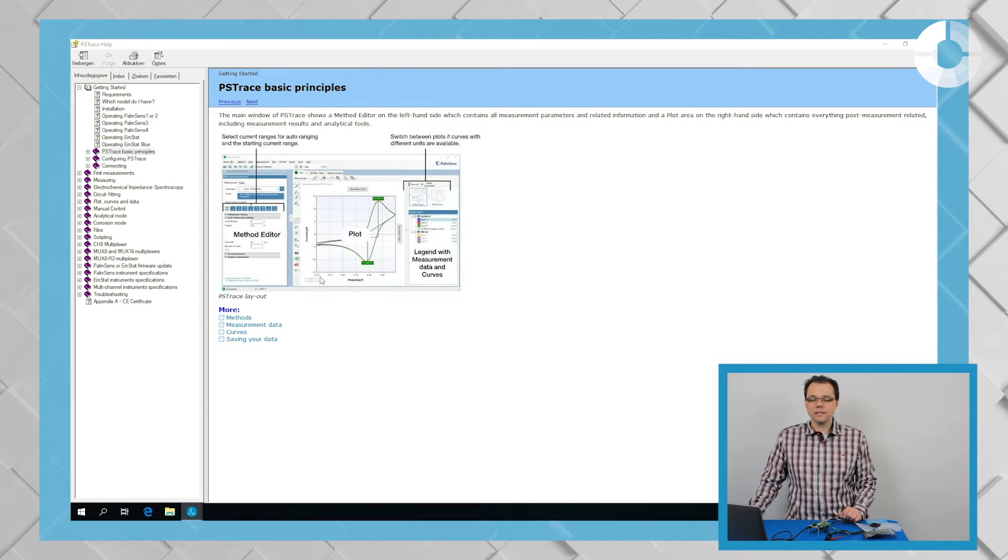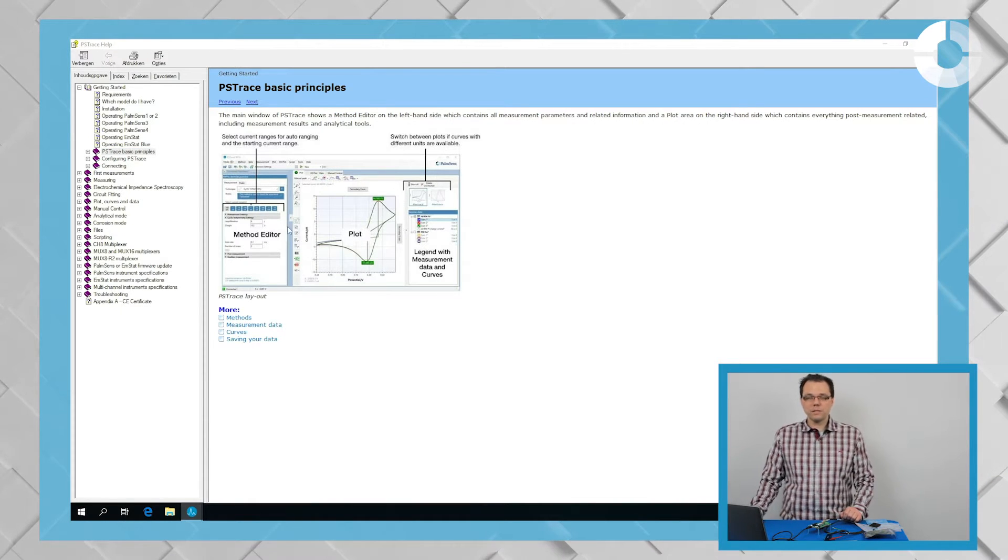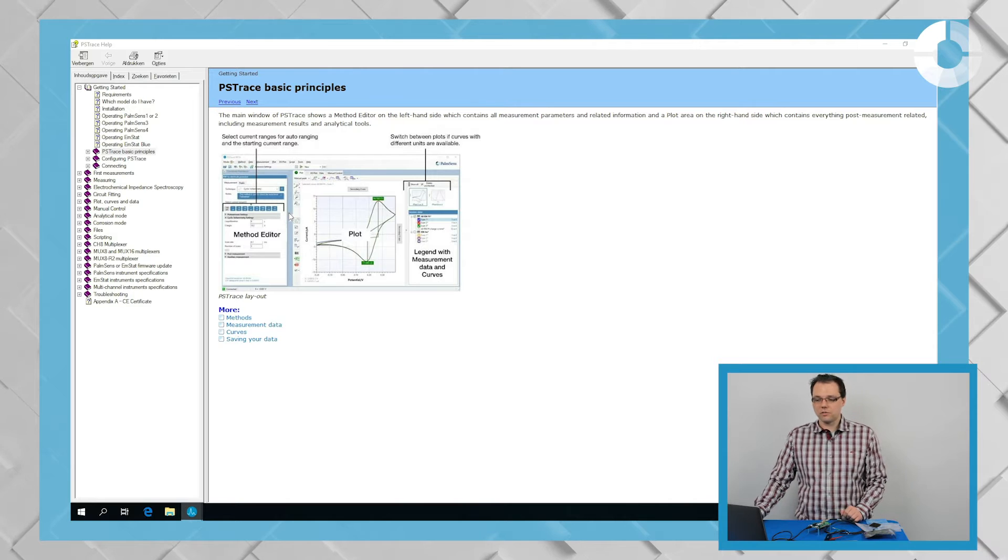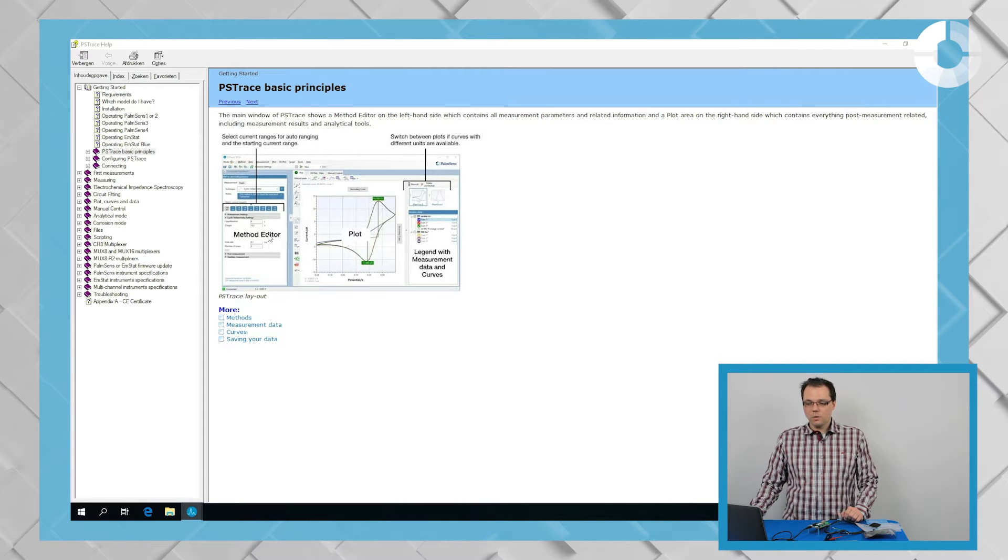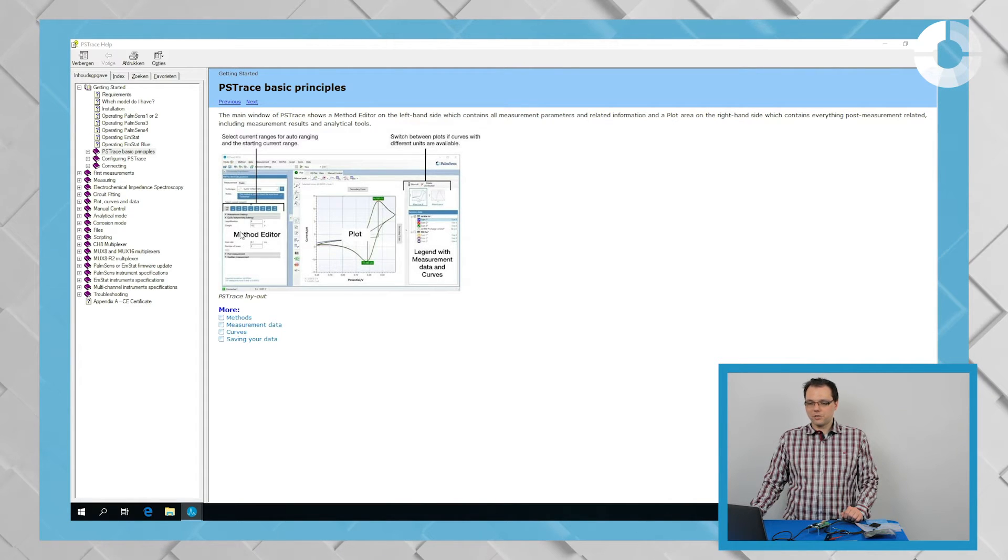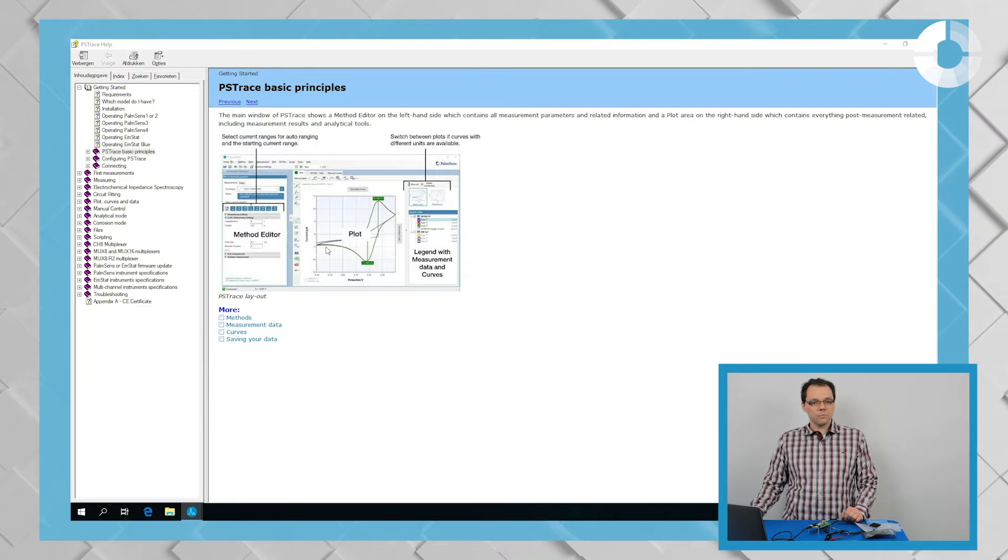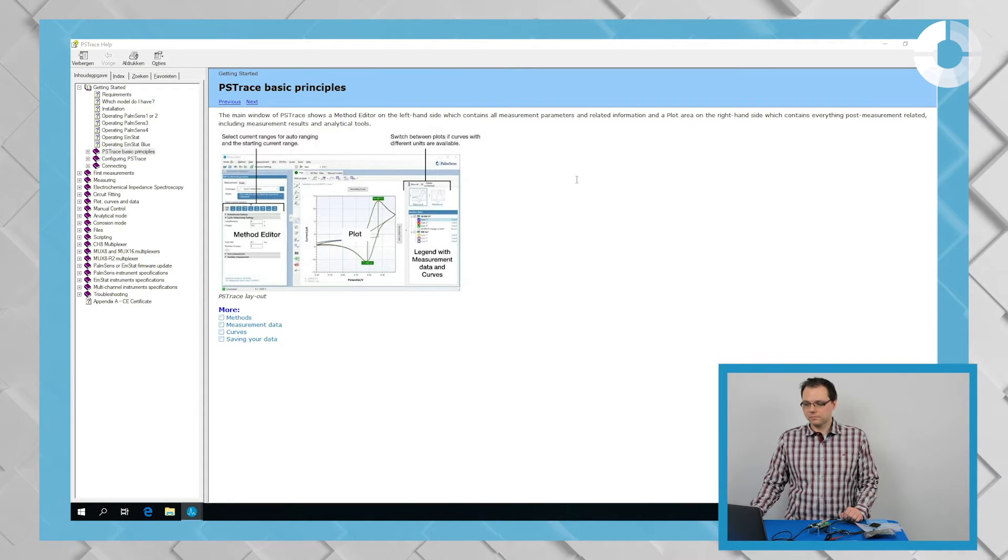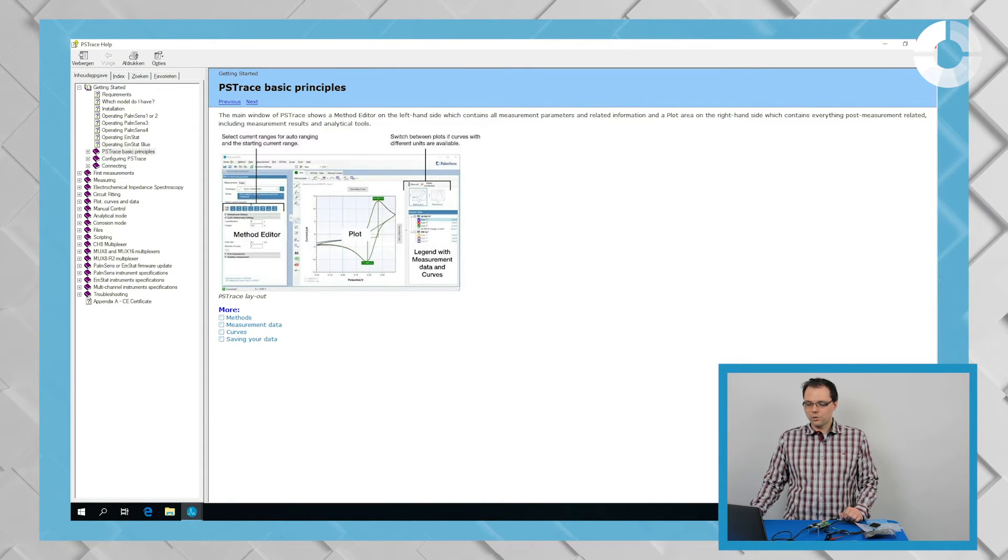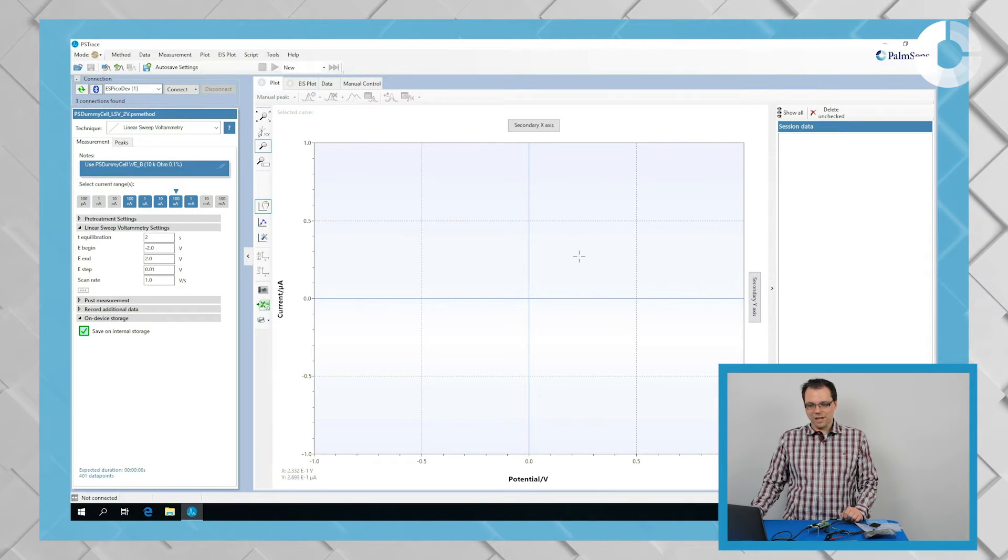Also, the help files for the principles of PS Trace will pop up. And I recommend to read these. It just takes a few minutes. But for now, we're going to skip these as well.